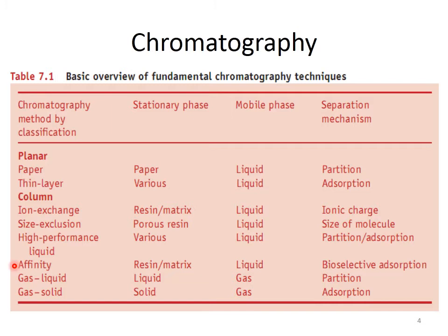Affinity chromatography is based upon the specific binding affinity of molecules of a particular type to the stationary phase. For example, there are certain types of proteins which contain histidine residues on them. The histidine residues can bind to nickel ions which are present on the stationary phase. So these proteins which contain histidines exposed on the surface can bind to the stationary phase containing nickel ions. So this is an example of a specific binding affinity.